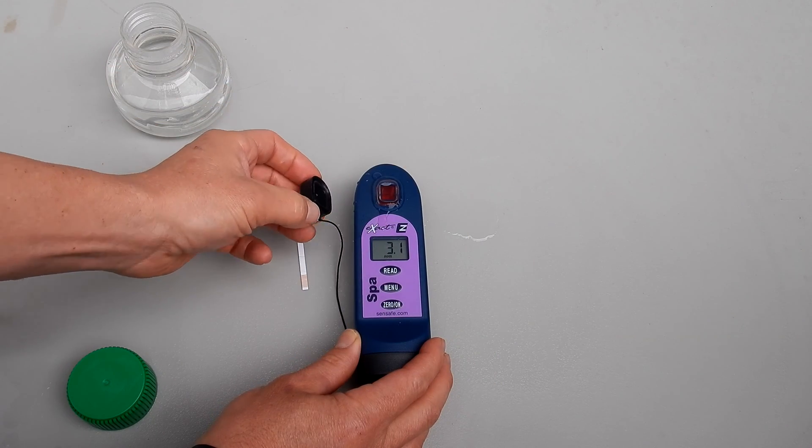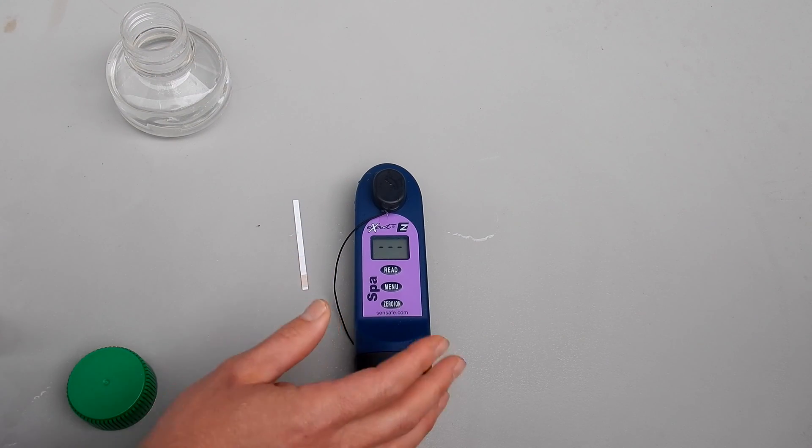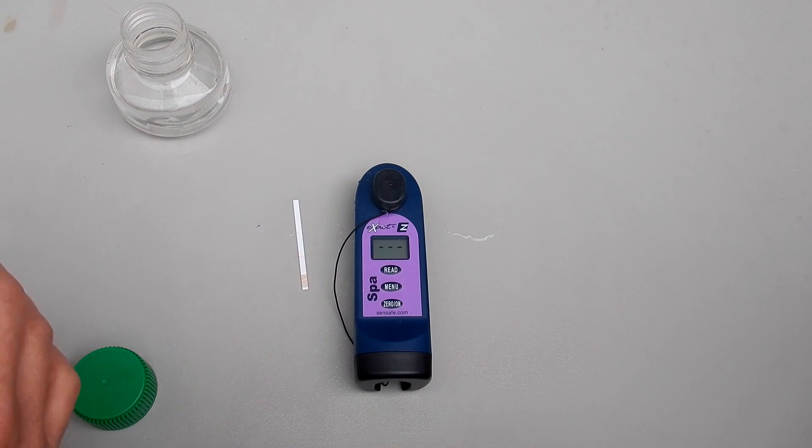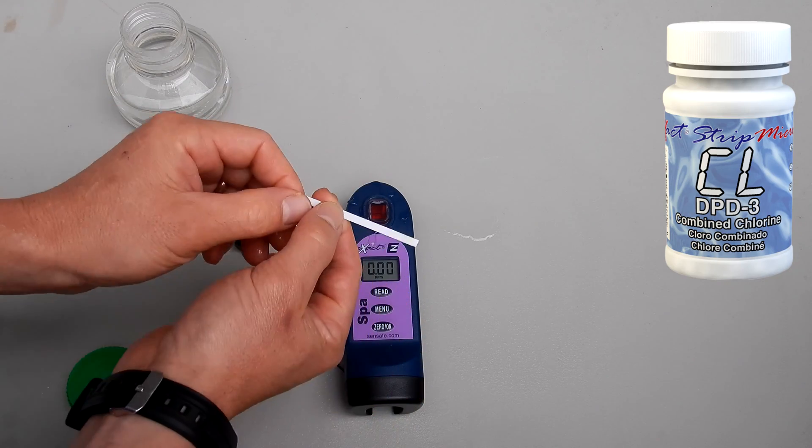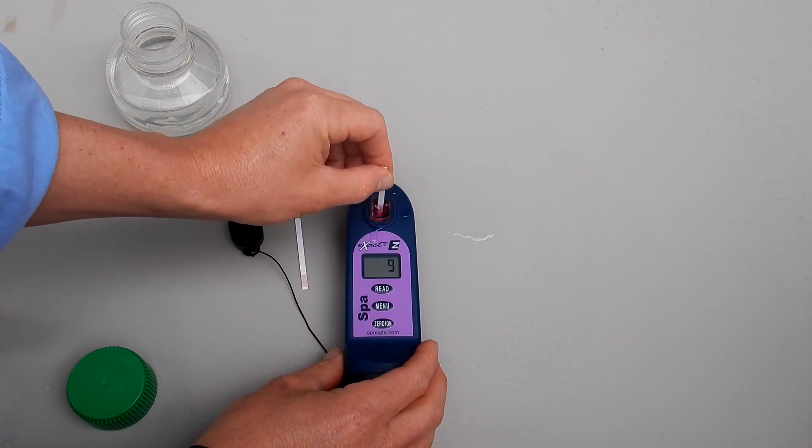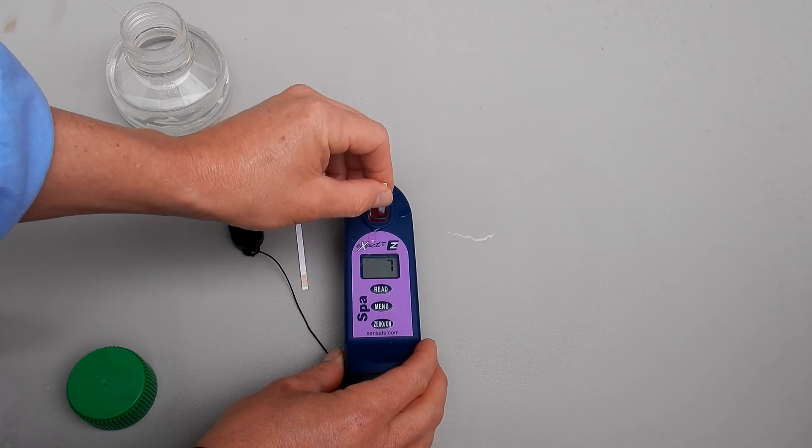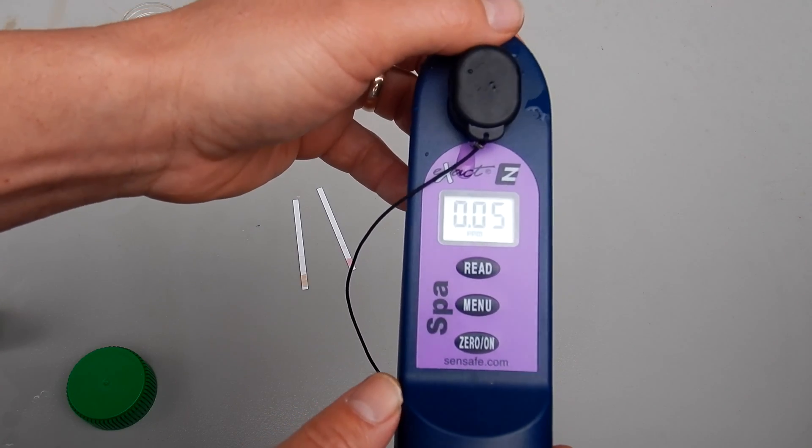To do the combined chlorine reading, you want to use the same water sample. Go ahead and hit zero. Then you'll take the CL-DPT-3 strip. Go ahead and hit read and start the strip and move it back and forth. This will give you a combined chlorine reading. It shows the combined chlorine at 0.05 parts per million.